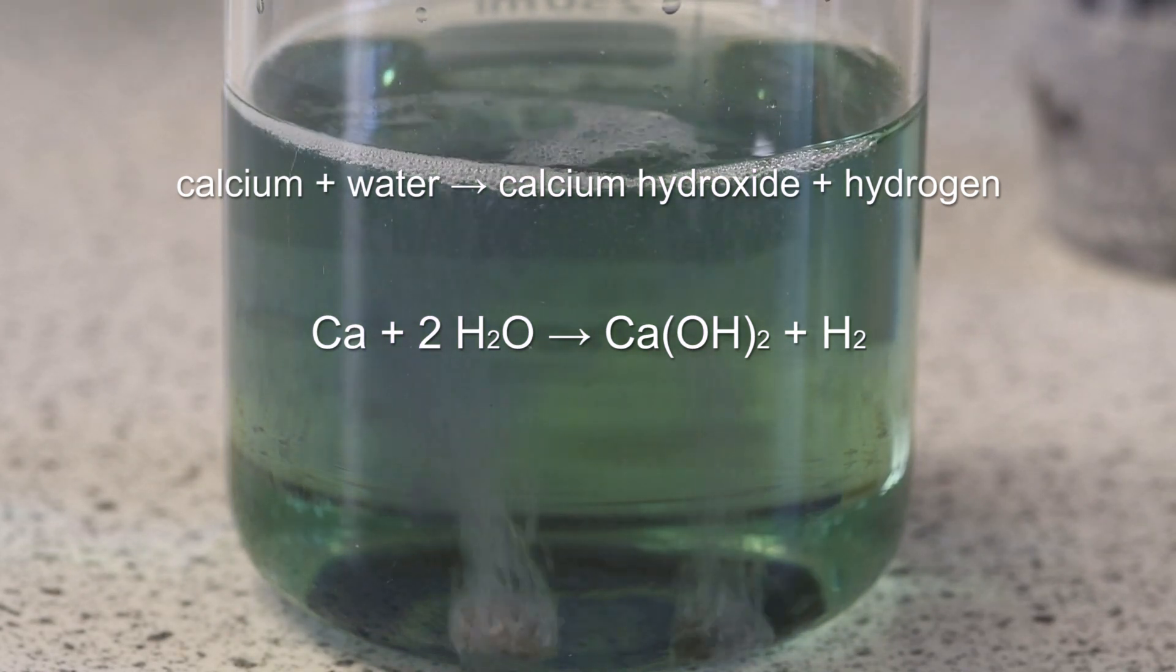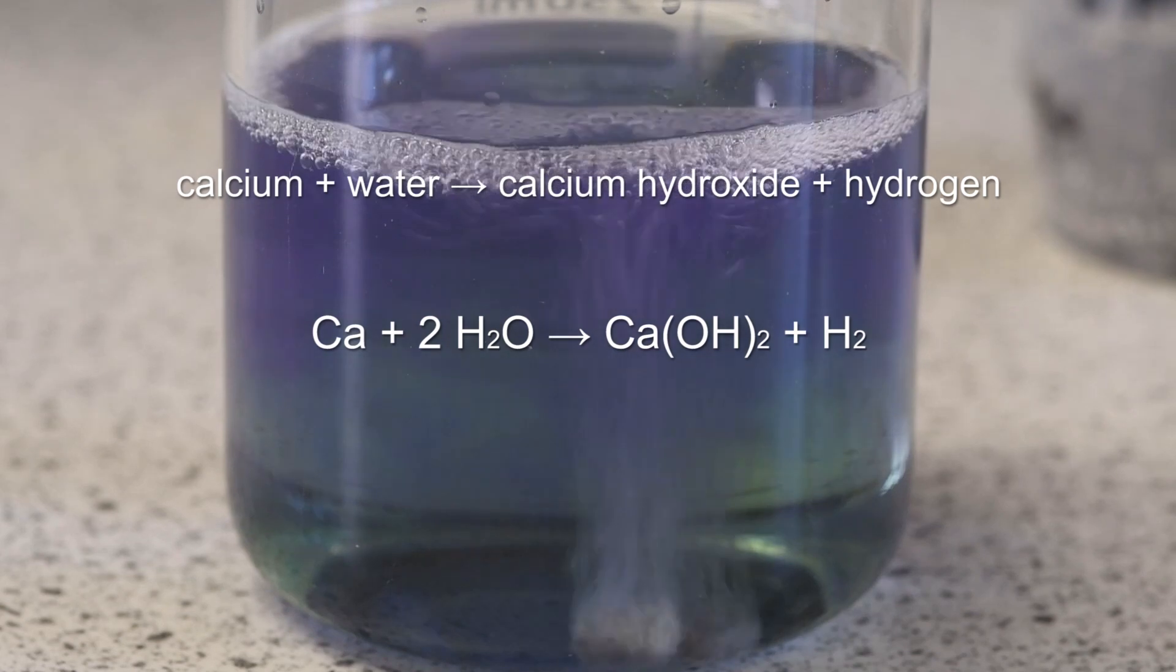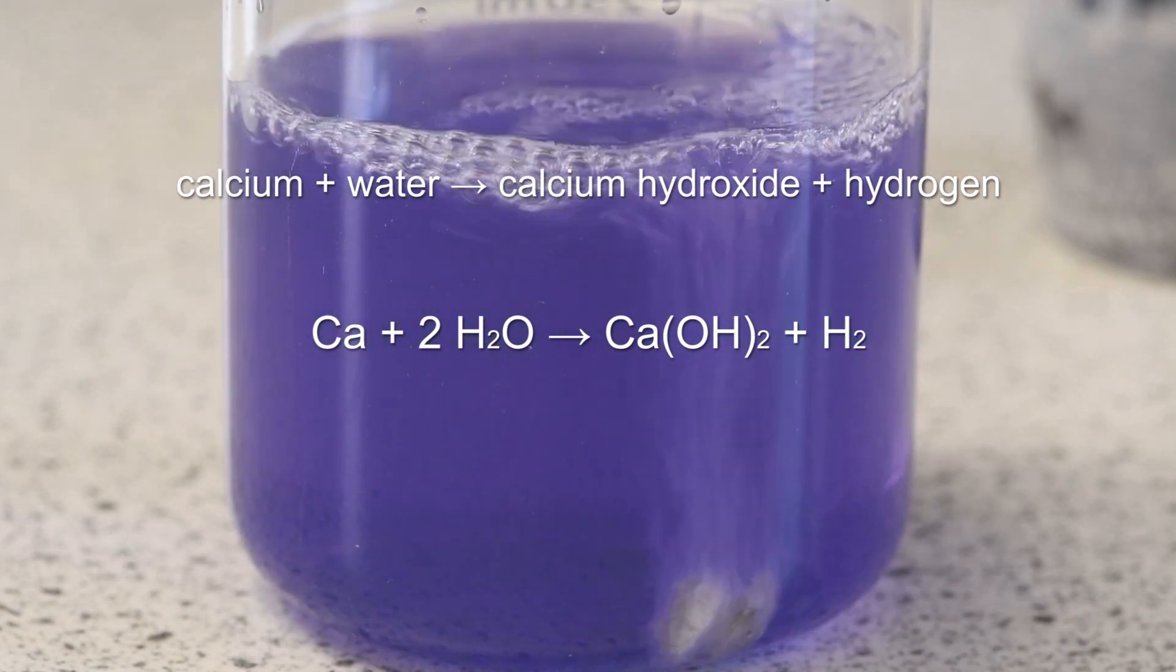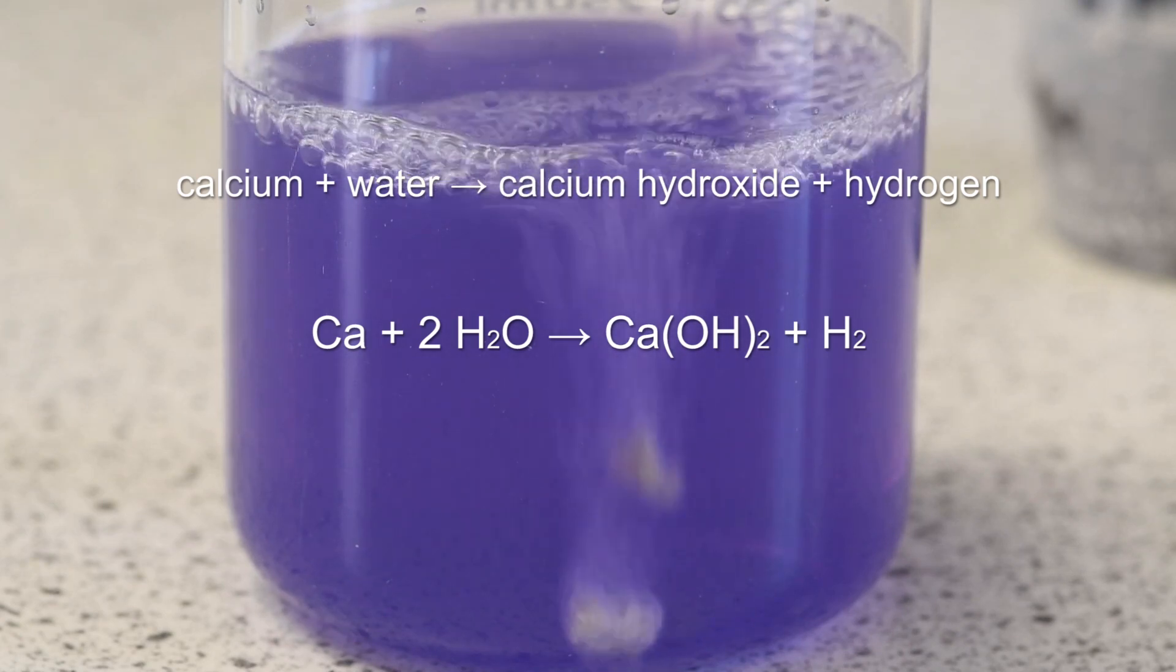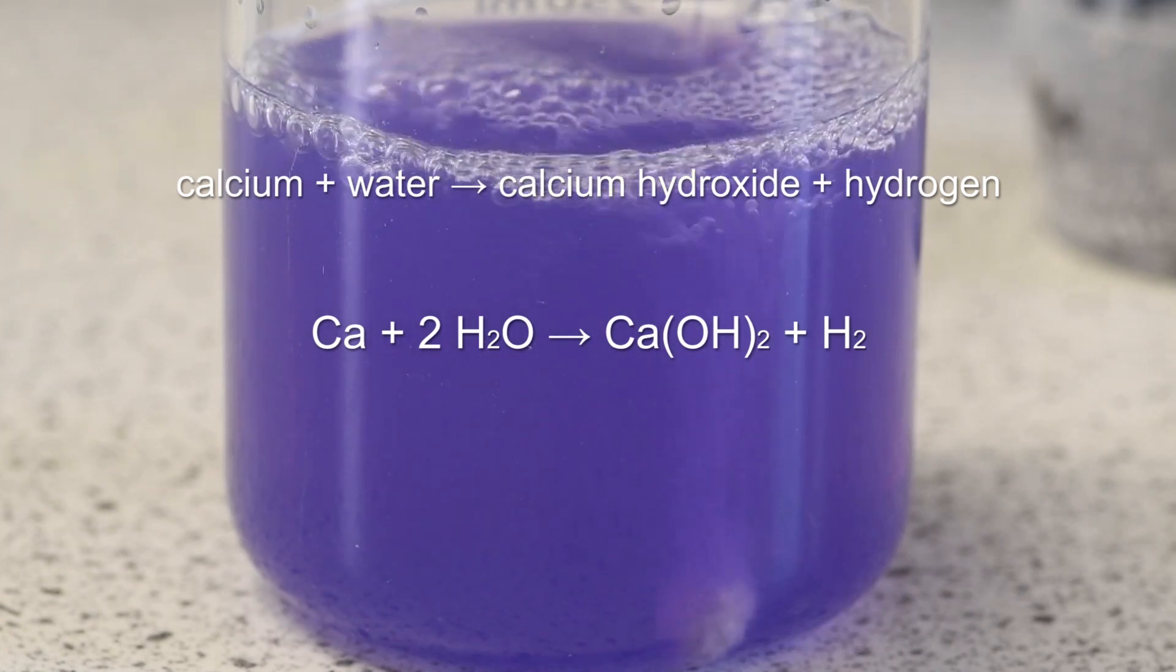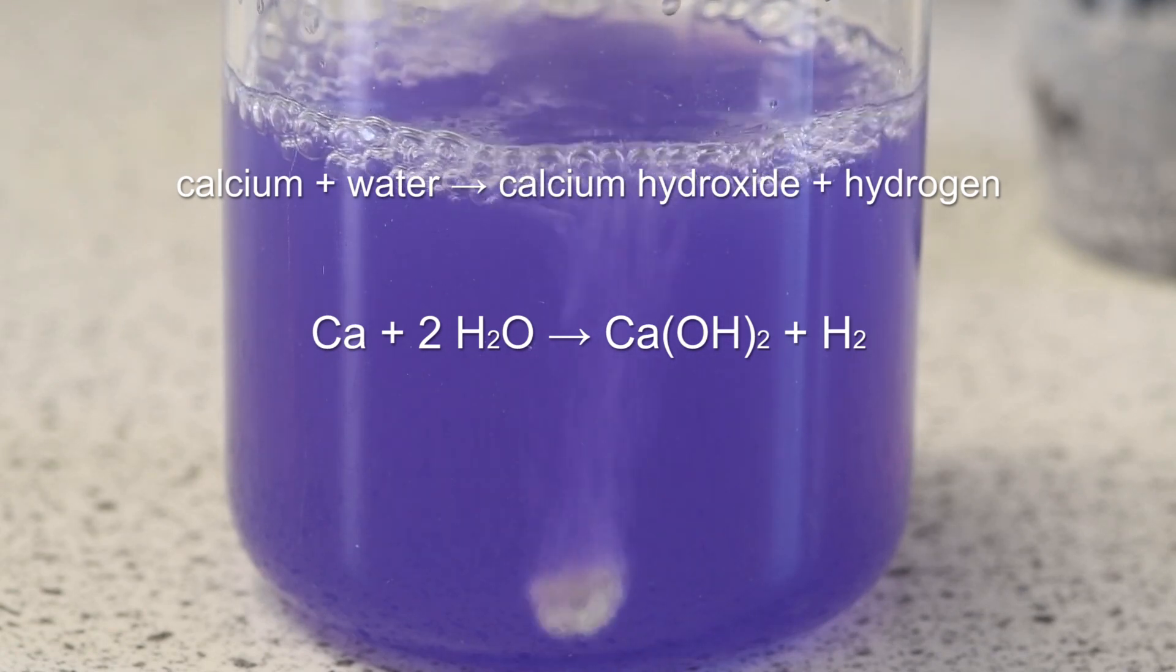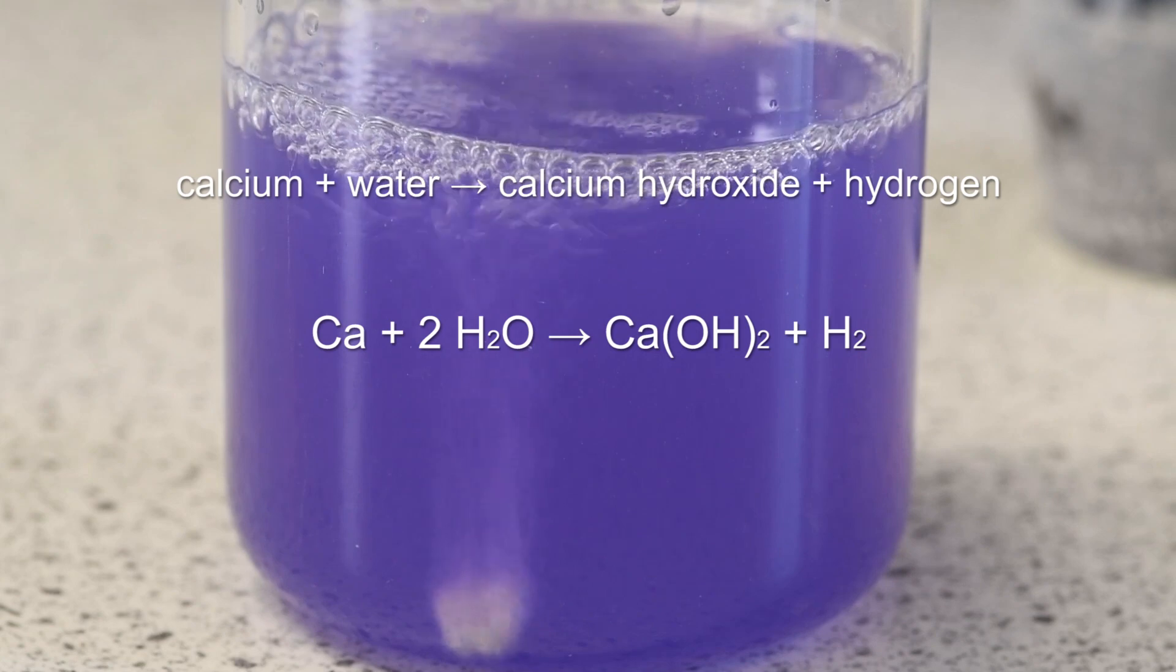It's also producing calcium hydroxide, so you can see the indicator color changing there from green to purple. The other thing that you'll notice in there is that because calcium hydroxide is not very soluble, the mixture is going quite cloudy as well as it reacts.